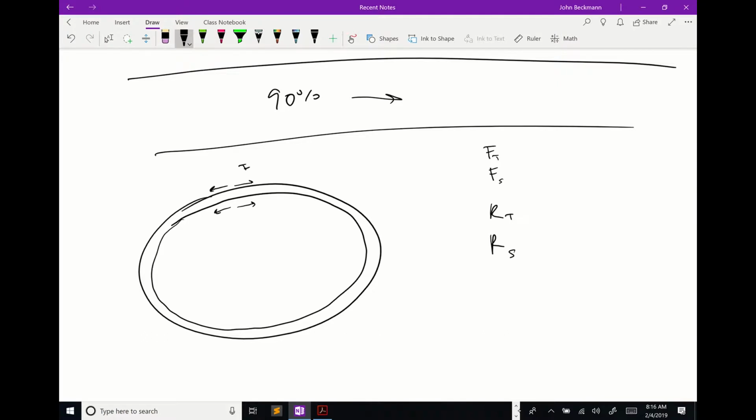So these would be your forward. You have your forward short, the reverse short, and the reverse long, or reverse T, whatever they call it. There's a long one and a short one for each pair. And the trick is that these primers have these extended regions that match each other. So you have 4 primers, 2 forwards, 2 reverses, and there's 2 short primers, a short forward and a short reverse, and then there's 2 long ones, a long forward and a long reverse.